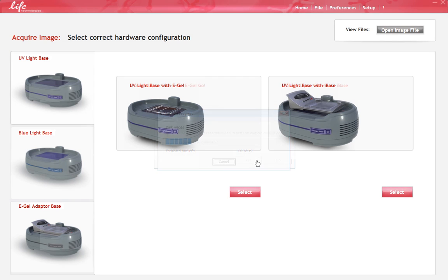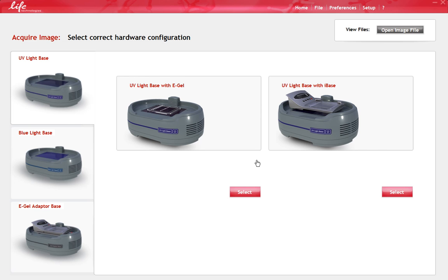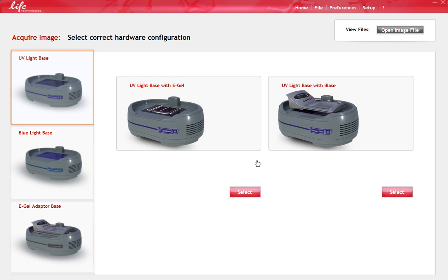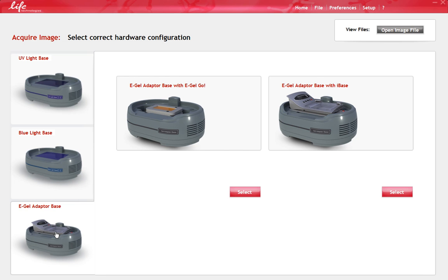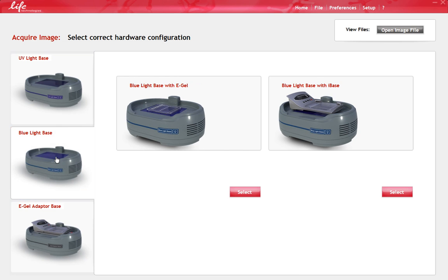To acquire an image, first select the base you're using. There are three possible bases: The UV Light Base, The Blue Light Base, and the eGel Imager Adapter Base. Once you have selected the appropriate base and gel configuration, select the Capture window to display a live image of your gel.